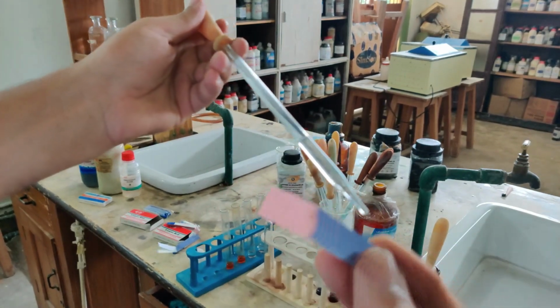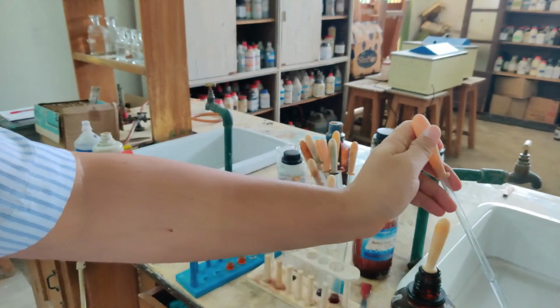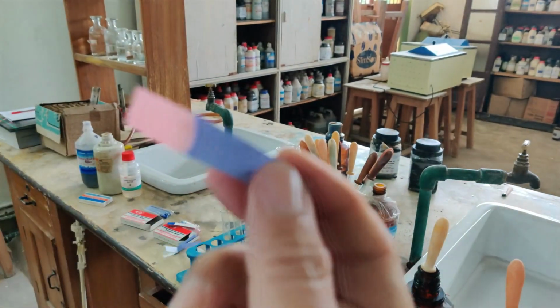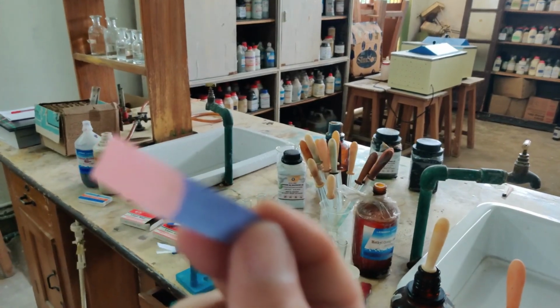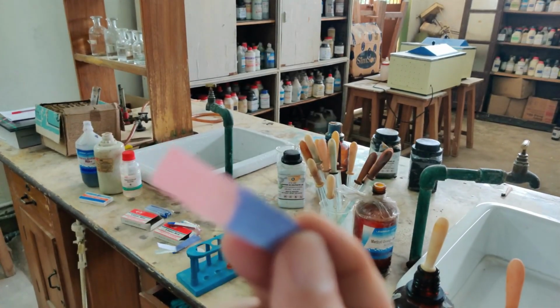For convenience we use a paper. Actually, you know that litmus is a solution, but for convenience purposes only we are using the paper. So you can see how nicely it has turned the color. This is what has turned to red.